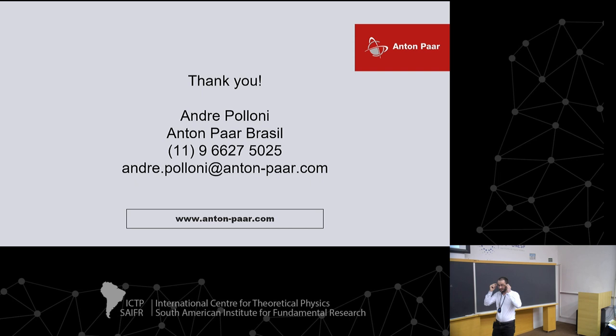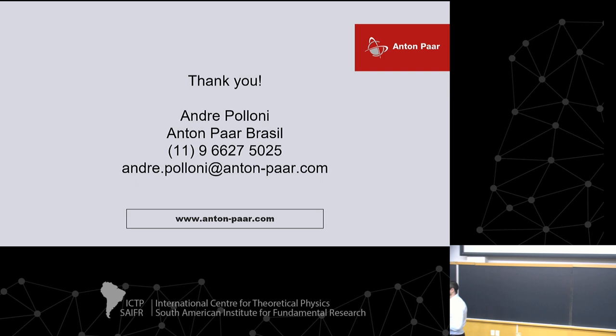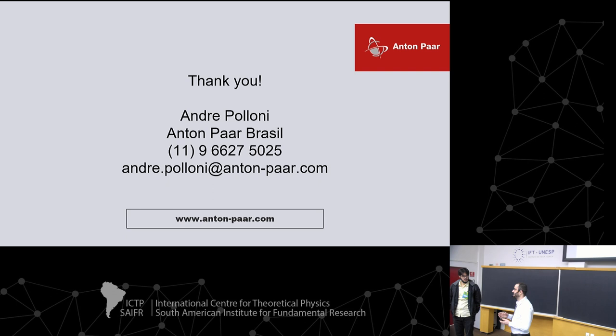I have a question about sample preparation for porosity measurements. Because you focused on the fact that you don't need to degas your sample, but how is it? It is a powder that you place on your sample holder. Yes, just simply like that. We have different size sample holders, and you can use most of them for powders, and we have a bigger sample holder for pellets, for example. The only preparation is that it's not good if you have an agglomerated sample, like a block, so it has to be kind of dry, but you don't need the gas, you don't need preparation at all.